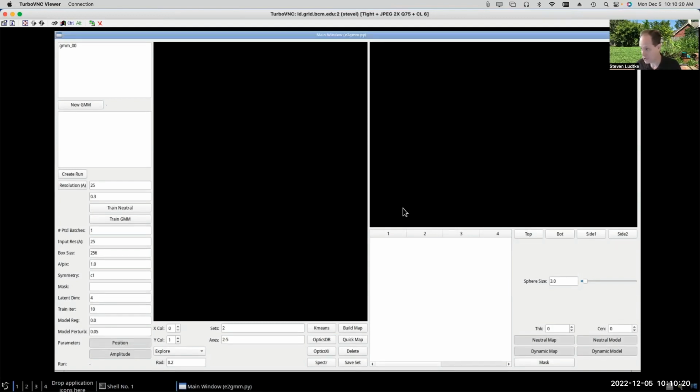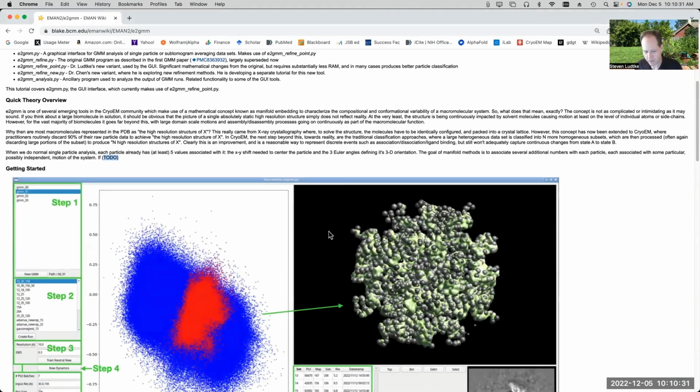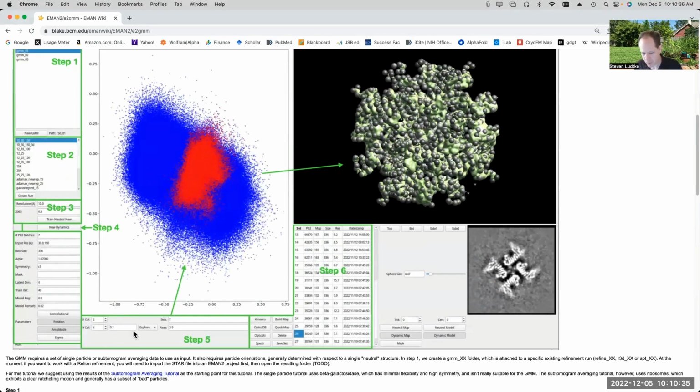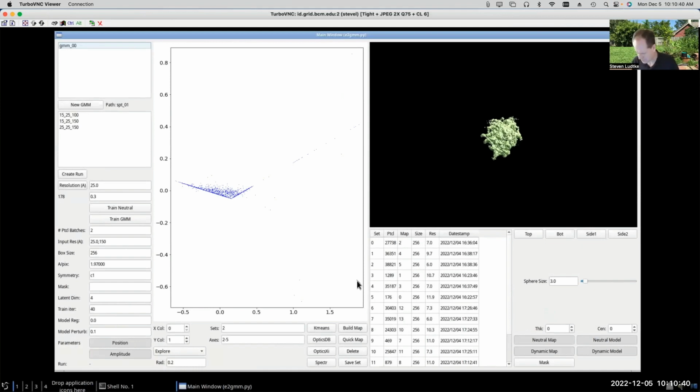The interface to the GMM is still being refined and developed in various ways. So you will still find things, so some of the things in the photo here actually disagree even with this, even though I only made it last week. Now, they don't disagree very much, just there were some rearrangements down here and that sort of thing. But there's still development going on in this interface, but it's definitely at least usable at this point.